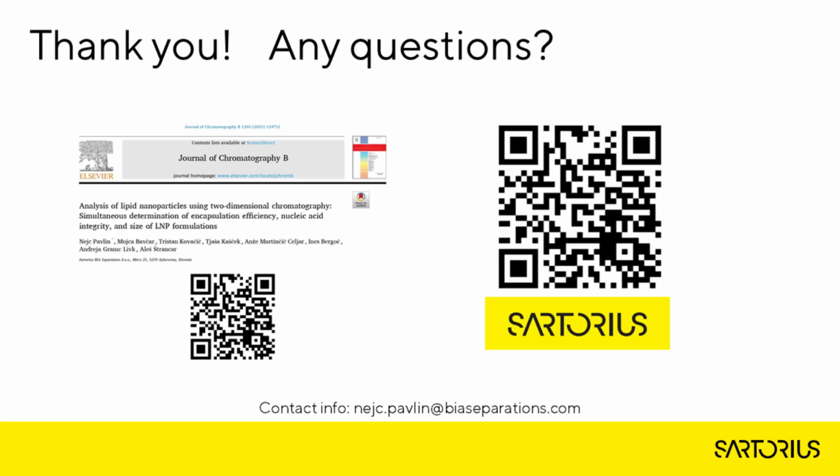All right, and our next question is, can you differentiate between full and empty LNPs using this analytical setup? Not yet. Using this system, we can really only see the LNP sample as a bulk.